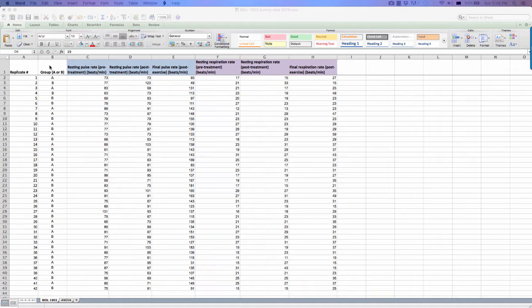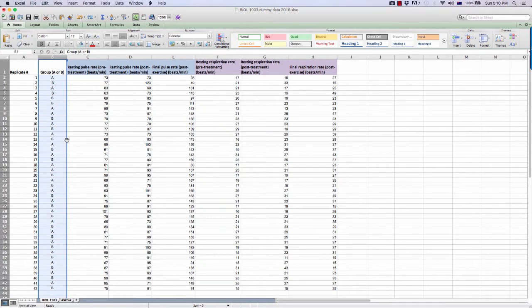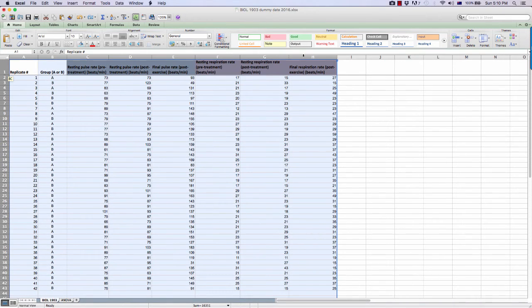Okay, in biology, we are usually interested in the population response. So the means and some measure of variability is what we're looking for. And we want to calculate these figures for each group. So notice in the spreadsheet that in column B, the data is not sorted by group, which is not very helpful for us. So let's select all the columns that contain data.